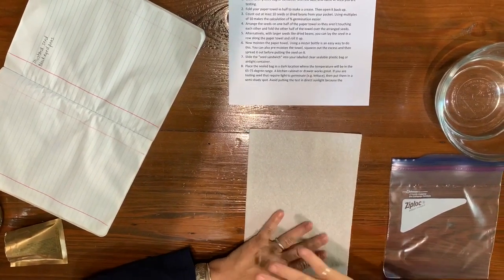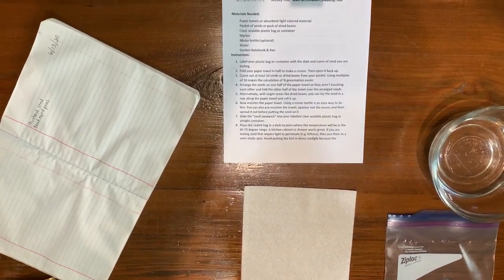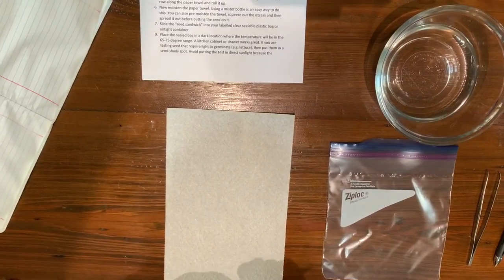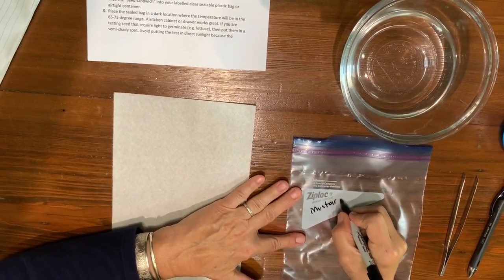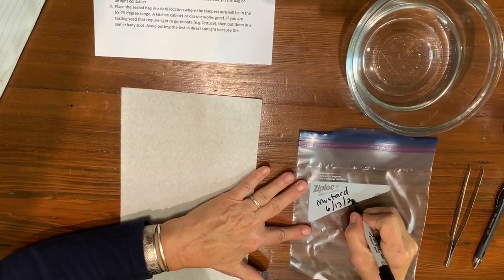Let's get started. Number one on the instruction sheet says to label your plastic bag or container. I'm going to put the date and the name of the seed. I'm going to do my mustard seed first, so I'm going to write mustard on here. And today's date is 6-13-20.